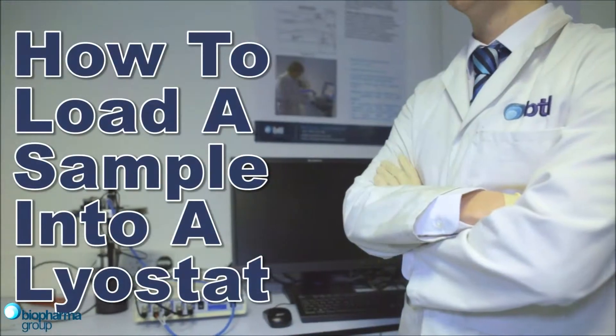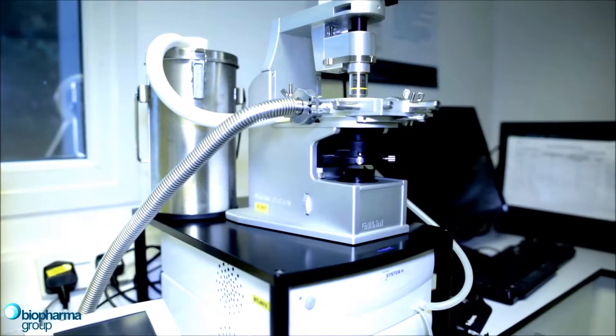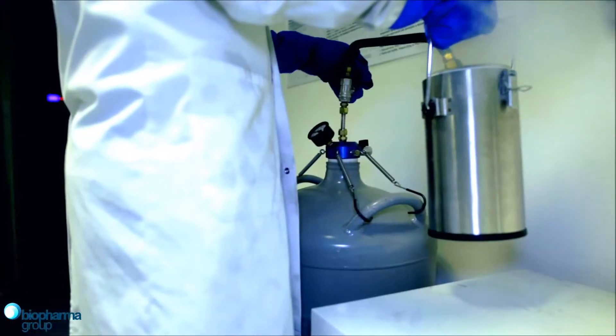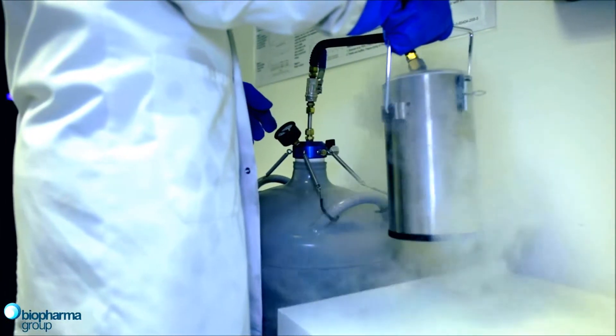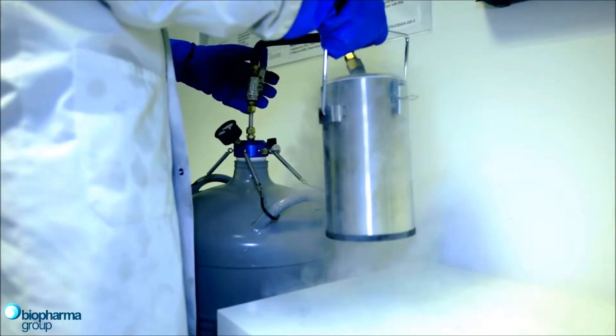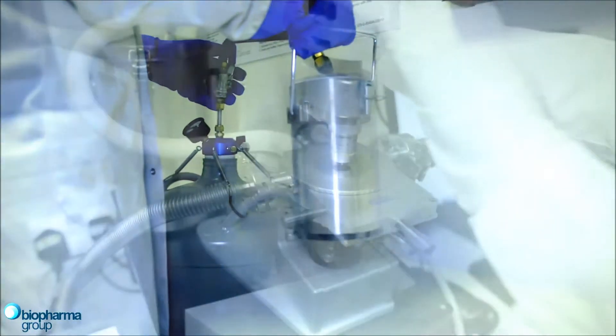In this video we'll be looking at the determination of freeze-drying critical temperatures, which we will need to use later on in cycle development. The freeze-drying microscope requires liquid nitrogen to cool the sample, so we'll need to fill the DEWA with sufficient liquid nitrogen to conduct the entire analysis.